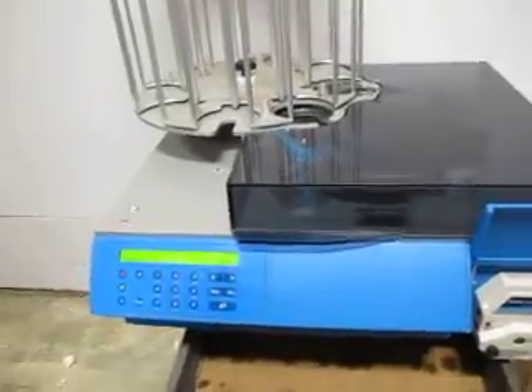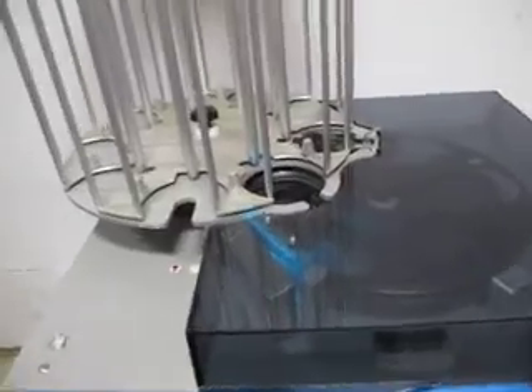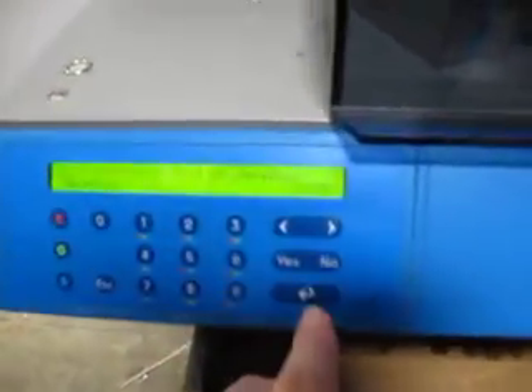300 automatic plate pour stacker unloader system, or something like that. I really don't know what I'm doing here, but I'm just going to press buttons.